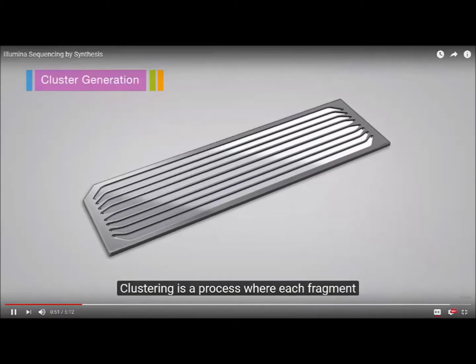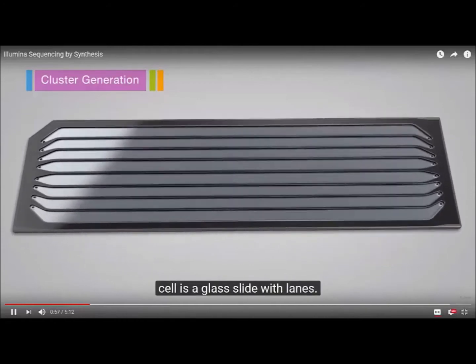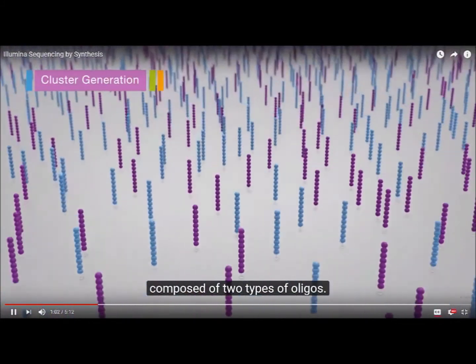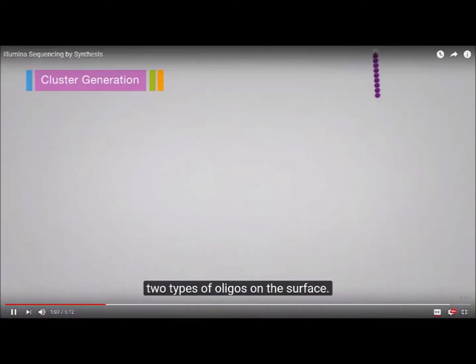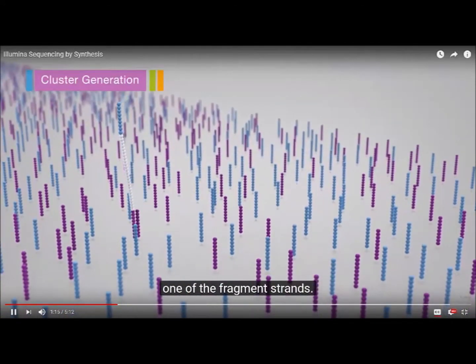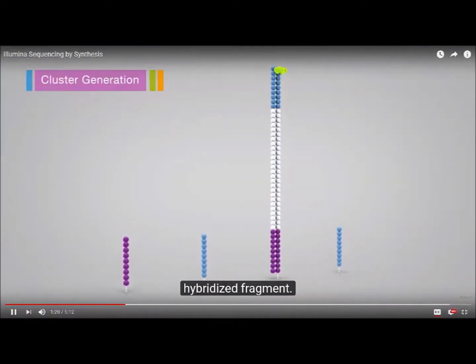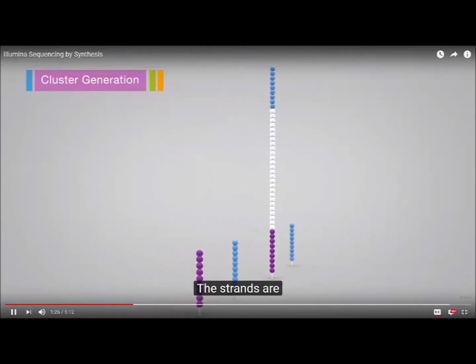Clustering is a process where each fragment molecule is isothermally amplified. The flow cell is a glass slide with lanes. Each lane is a channel coated with a lawn, composed of 2 types of oligos. Hybridization is enabled by the first of the 2 types of oligos on the surface. This oligo is complementary to the adapter region on one of the fragment strands. A polymerase creates a complement of the hybridized fragment. The double-stranded molecule is denatured, and the original template is washed away. The strands are clonally amplified through bridge amplification.